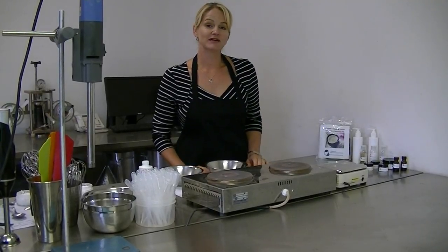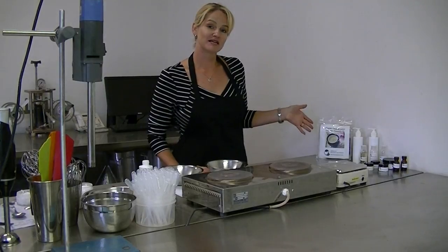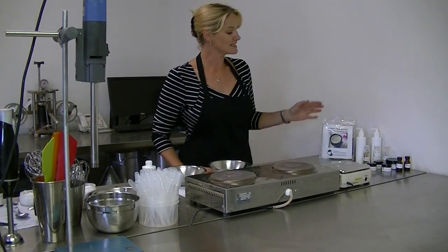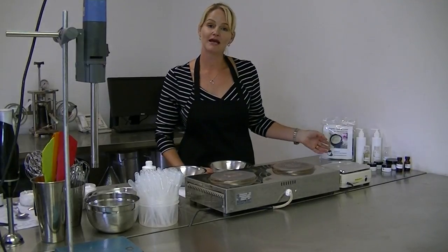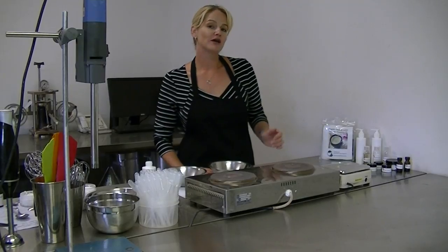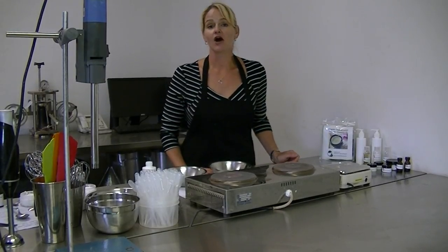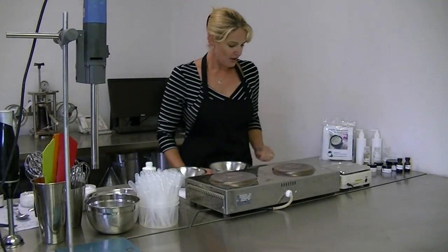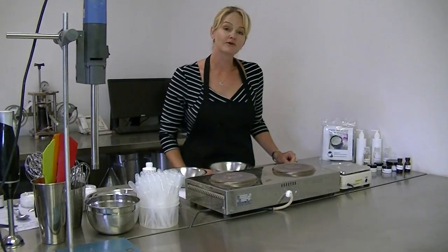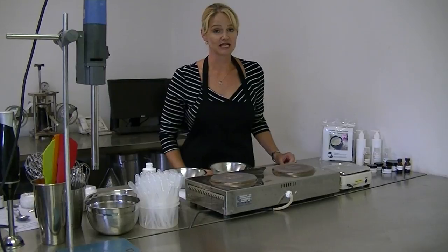Today I am going to be preparing a standard emulsion using our organic cream and lotion cosmetic chemistry kit. These kits are available online as a complete package and will make at least 200 grams of organic cream or lotion. You may also be viewing this video as part of your studies with us on how to make a basic emulsion. Before using any raw materials, please make sure you have familiarized yourself with the associated MSDS to ensure safe use.